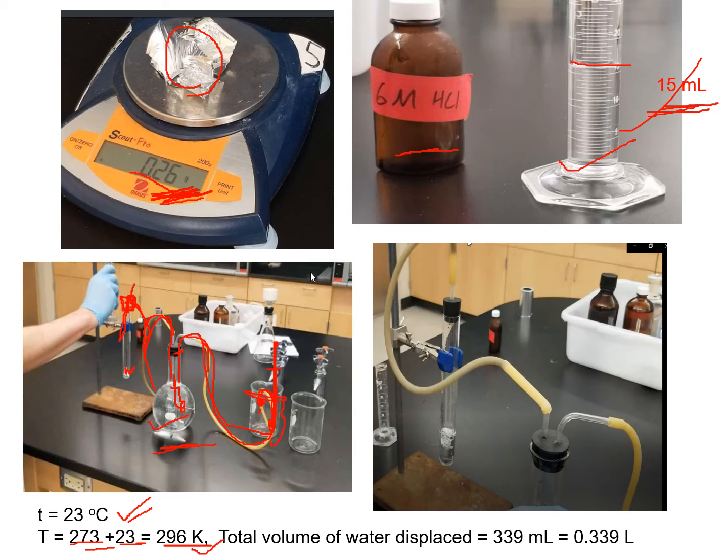So how much water do you get here in this beaker? This is the total volume of water displaced or collected here, displaced by the hydrogen. So that much water is accumulated in the beaker, meaning that much hydrogen is being generated during the reaction. You see that?